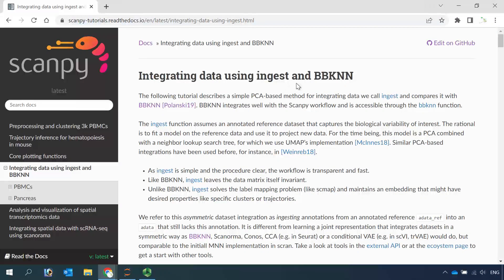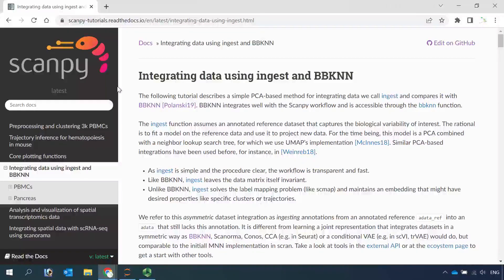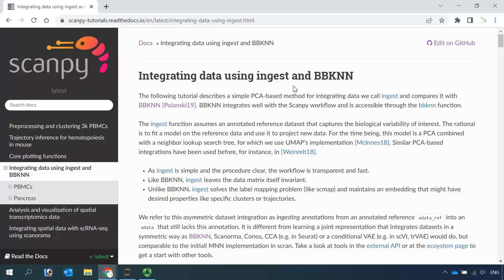The ingest function is different from BBKNN. BBKNN integrates data from datasets that were not analyzed before. But for ingest, mapping is a better word than integration. Because to use ingest, we need to use an annotated dataset as a reference dataset, then map an analyzed dataset using the cluster information from the reference dataset. In today's video tutorial, I'm going to show you how to use the ingest function in Scanpy and map a new dataset to an annotated dataset.